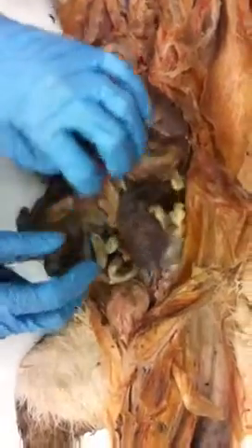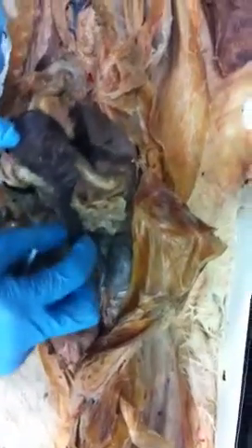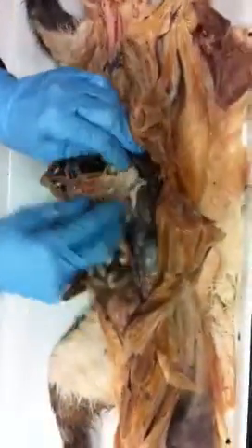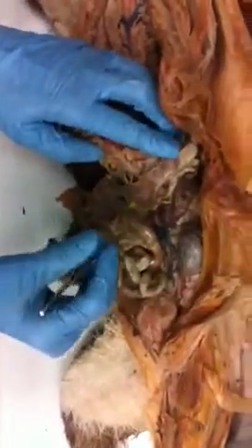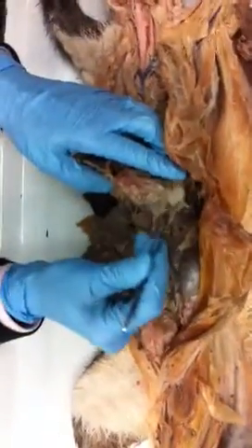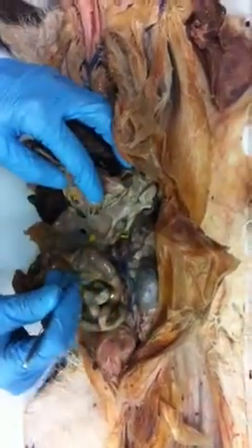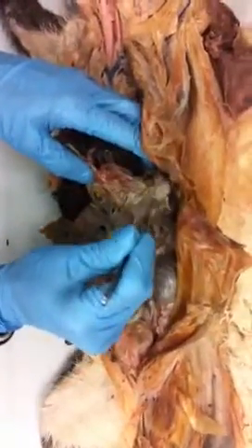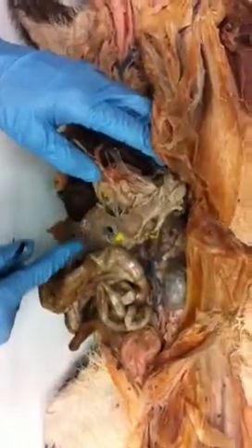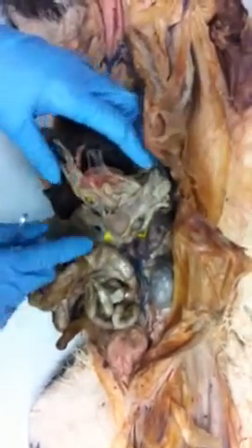Okay, the way that's accomplished is thanks to the pancreas. So if we kick all this junk out of the way, this over here, by the way, the beef teriyaki, that's spleen. That's not a digestive organ, but that's spleen. Okay, so we get that out of the way. Pull this over. You can see this tissue right here. It's not well defined like a liver or a gallbladder or anything, but it's this chunk of tissue right here. Comes all the way over to the duodenum. So it attaches to the spleen, runs under the curve of the stomach over to the duodenum. That's the pancreas. Okay, glandular tissue.